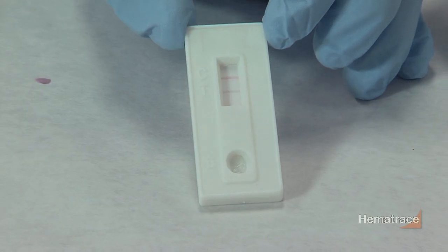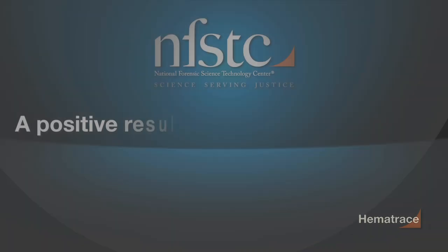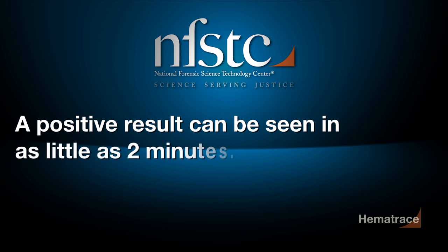A positive result is indicated by the presence of two lines, one in the T region and one in the C region. A positive result can be seen in as little as two minutes.